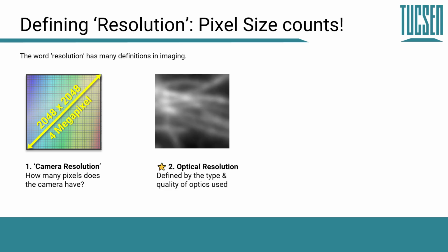But that's not the definition that I'm going to be using in this course, because when we're in scientific imaging, we mean something quite literal by resolution. What can we resolve? And again, I'll define this in more rigor later on. But the key thing to know is that we have, first of all, an optical resolution of how blurred our sample is, how much are we actually getting the details of our sample delivered to the camera by the optical system.